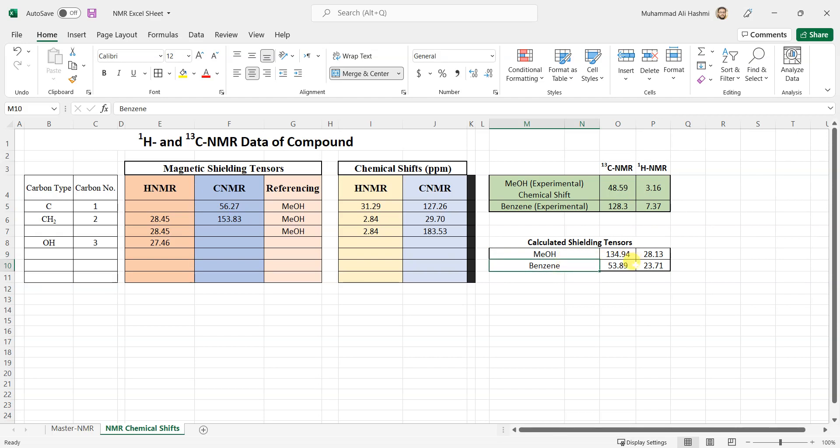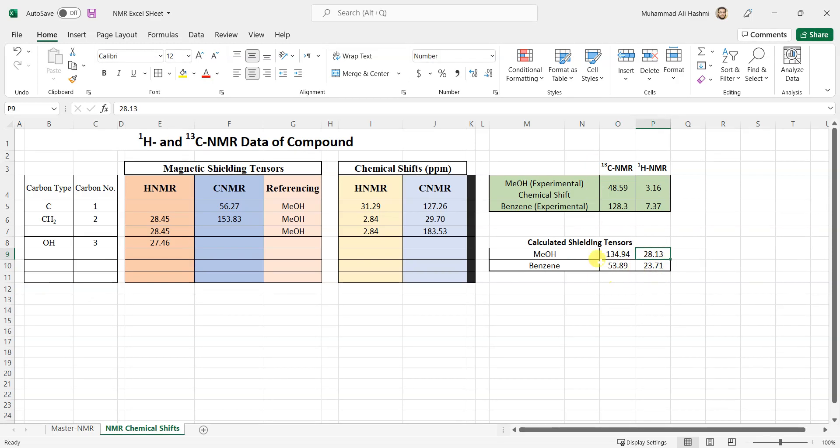Here are the shielding tensors for methanol. C13 NMR shielding tensor is this one, so this is the calculated one from Gaussian and this is the experimental one from the literature. I have put these values over here as well. Now you can see that, keep one thing in mind, that you should calculate your compound and the solvent at the same level of theory. Otherwise you won't get that good results because if you compare them at different level of theories that won't make sense.